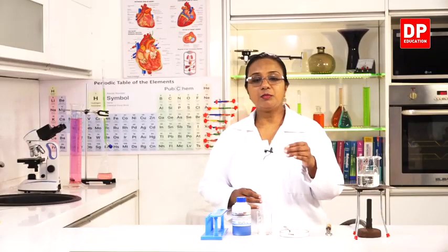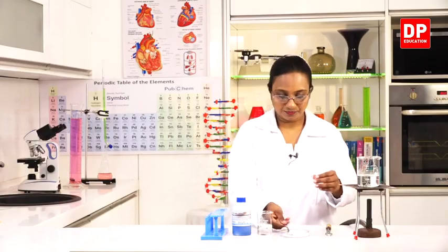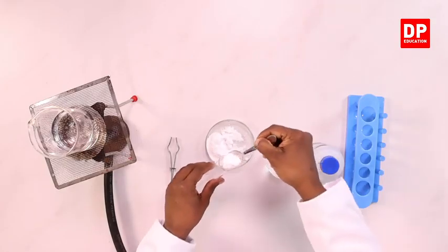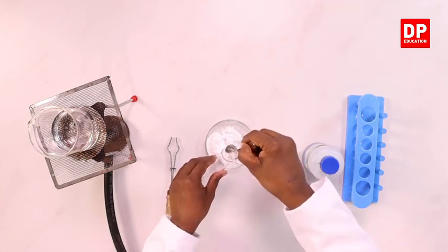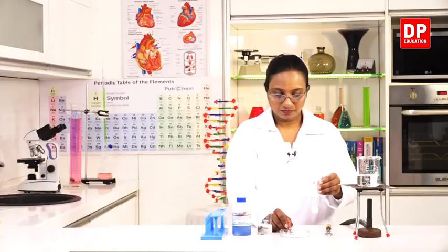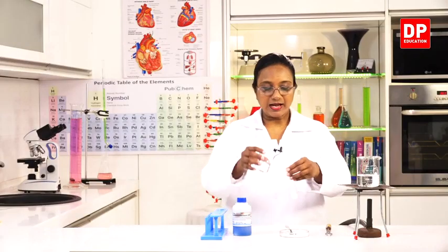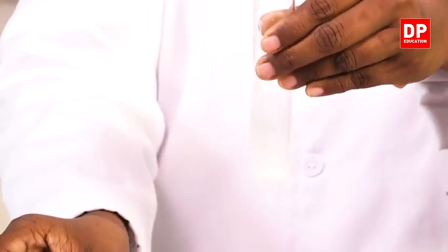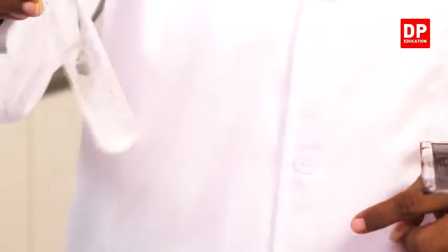So to that, I will add certain amount of glucose into the boiling tube and add water. As you know, since glucose is a monosaccharide, it can dissolve very easily in water. And we make sure that it dissolves well.